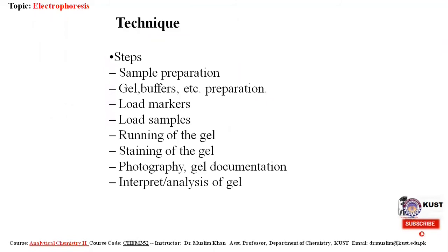So, what are the steps involved in this electrophoresis technique? First of all, sample preparation is needed. In each technique, you know that sample preparation is needed.